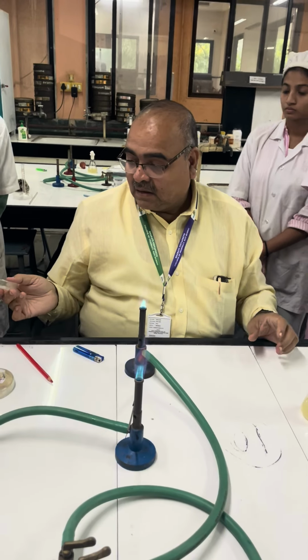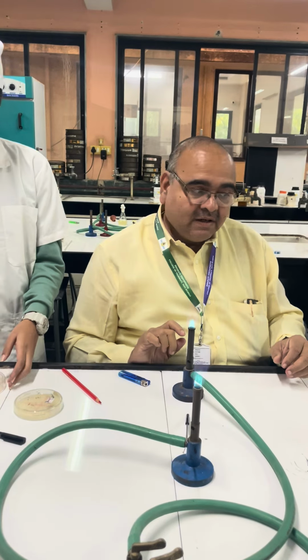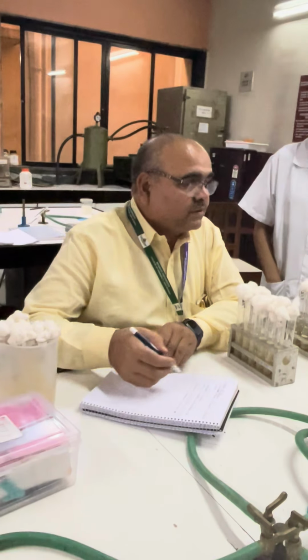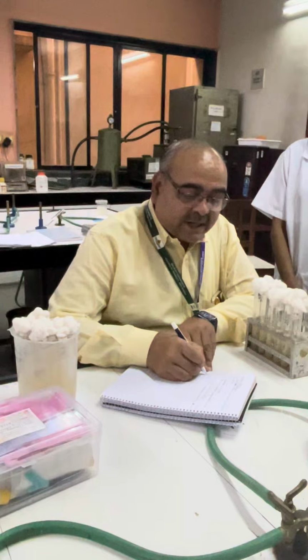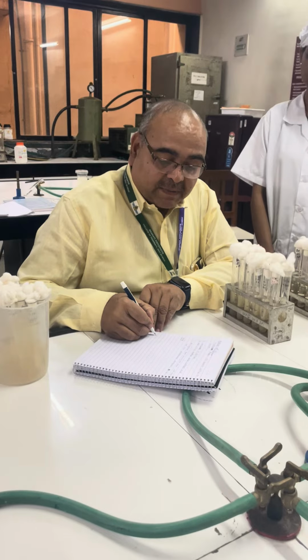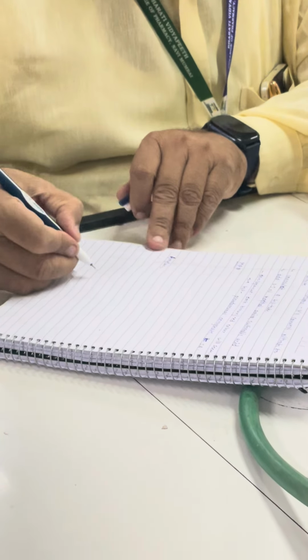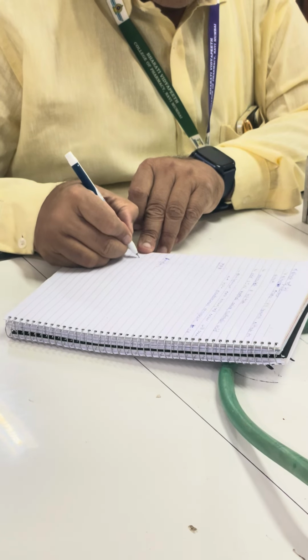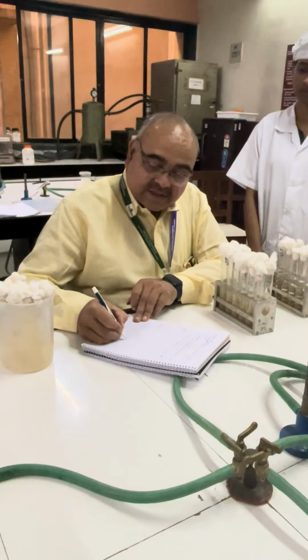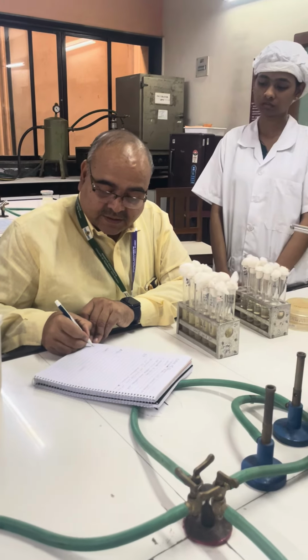And inoculate three-fourths, then turn it and inoculate the remaining one-fourth. See, just listen carefully. You have performed which practical? MPN, right? You have performed another practical, that is the amylase test. Then catalase test, then oxidase test and nitrate reduction test.